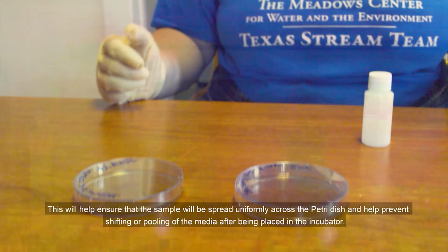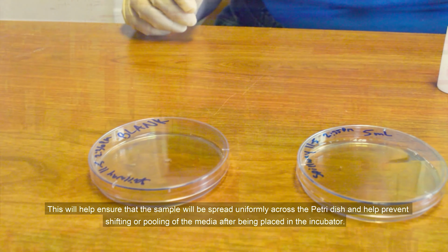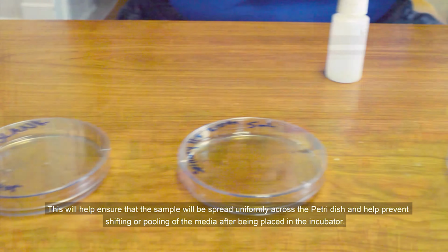This will help ensure that the samples will be spread uniformly across the petri dishes and help prevent shifting or pooling of the media after being placed in the incubator. While the petri dishes gel up, this is a good time to turn on the incubator to ensure the appropriate temperature will be reached before loading petri dishes.